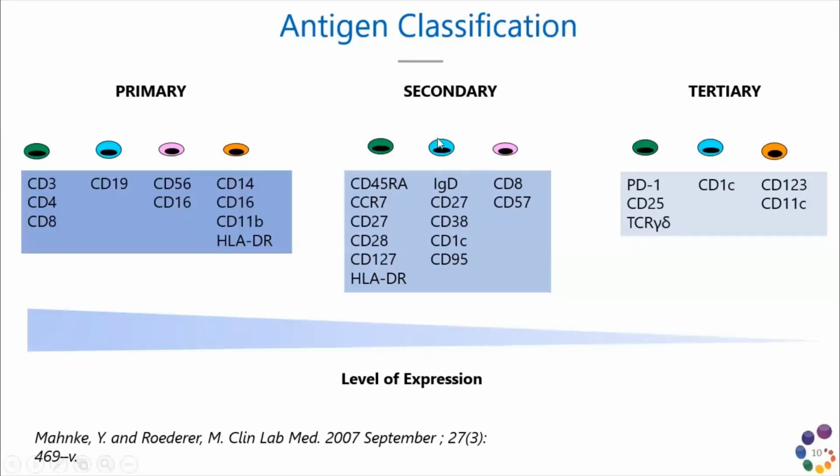The secondary level of antigens have slightly lower levels of expression, and they often show up as a smear of staining in the dot plots, as there's a gradient of expression levels within the cell type. Some examples here include CD45RA and CCR7. Also, for some cell types, like our NKT cells in today's panel, markers like CD8 can be used for subsetting these cells, and it has a lower level of expression on this particular cell type compared to the T cells we discussed earlier.